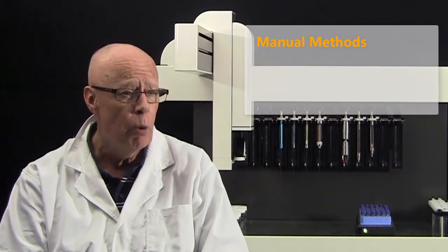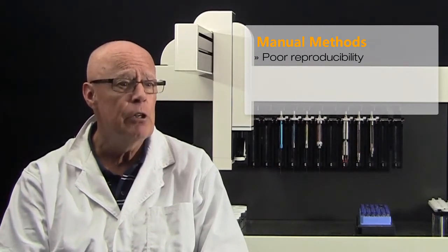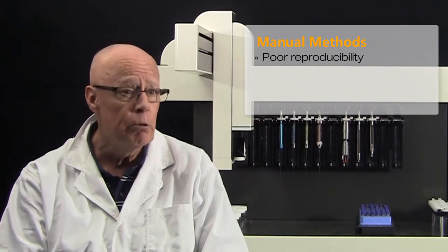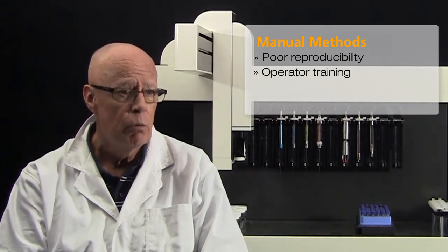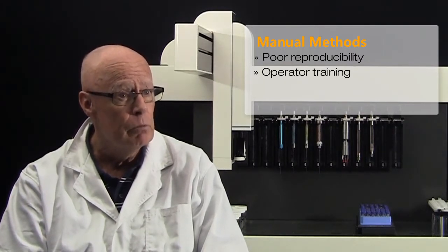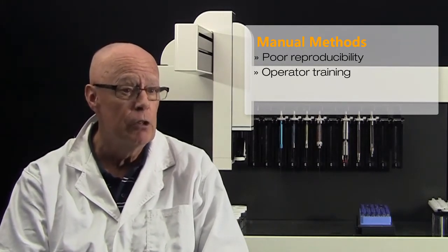Before we get to the ePrep, let's consider some of the issues with manual preparation, which is the norm in labs. There is typically poor reproducibility from operator to operator, and especially using the same method from lab to lab. The operator needs to be trained, and generally the technician in this position will not be there for very long because they are either promoted or, worse still, they could leave the company. So if that happens, you have to get a new operator and retrain them.